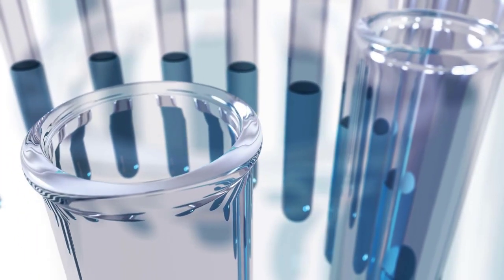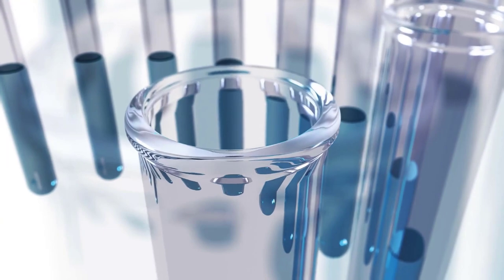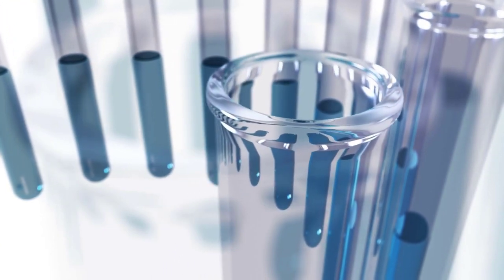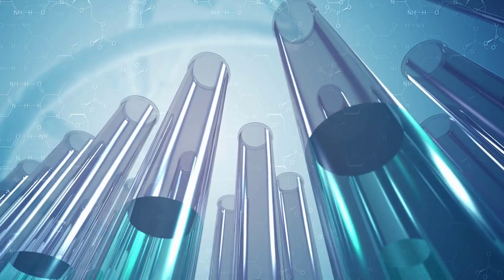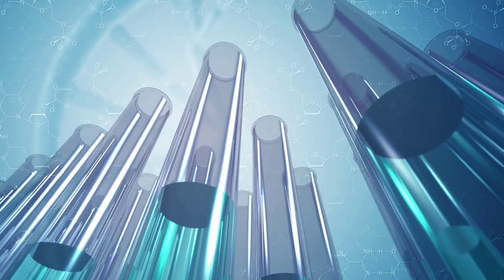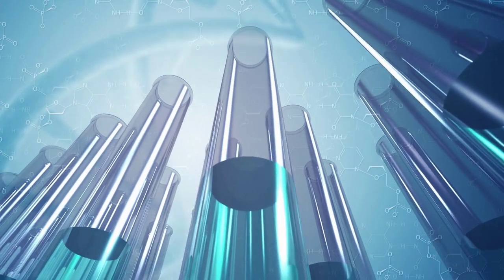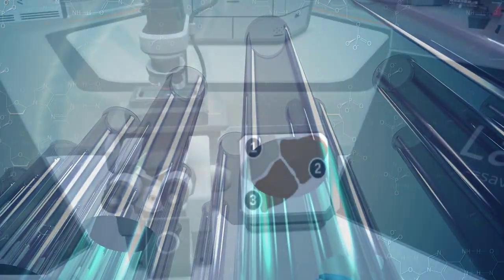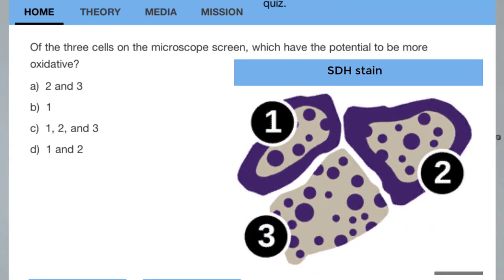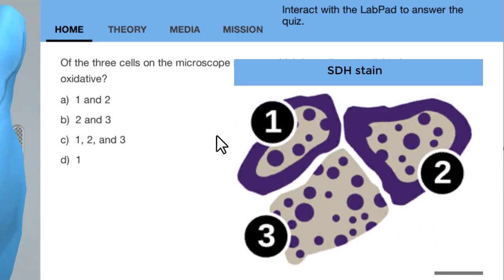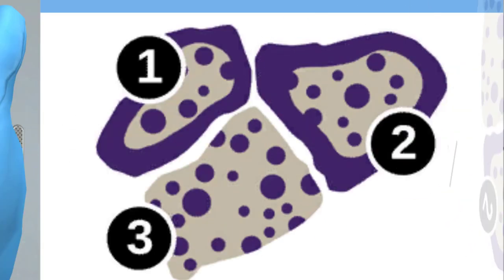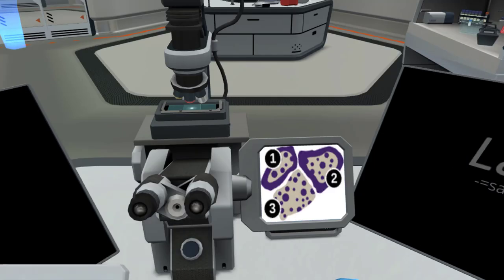Another assay, the SDH assay, uses nitro-blue tetrazoleum to test for the presence of SDH in mitochondria. This gives oxidative cells with many mitochondria a pretty purple speckled appearance and non-oxidative muscle fibers will be paler and more sparsely speckled. Of the three cells on the microscope screen, which have the potential to be more oxidative? Great work! Of course the two more intensely stained cells have more SDH and therefore, higher potential to be more oxidative.